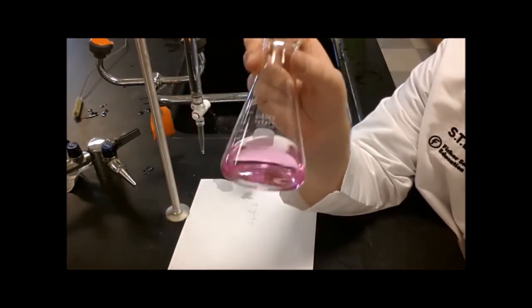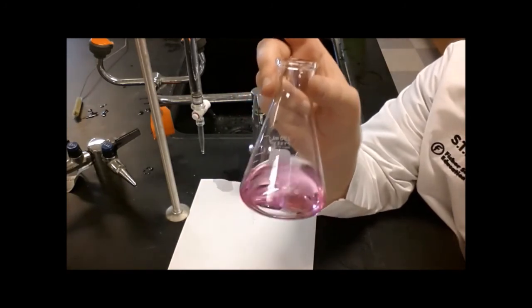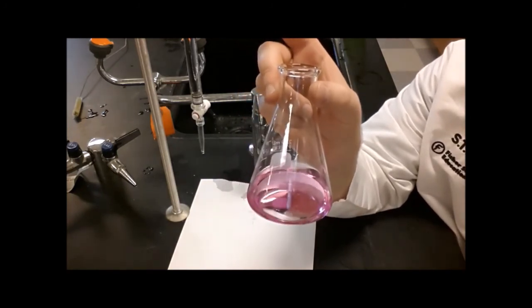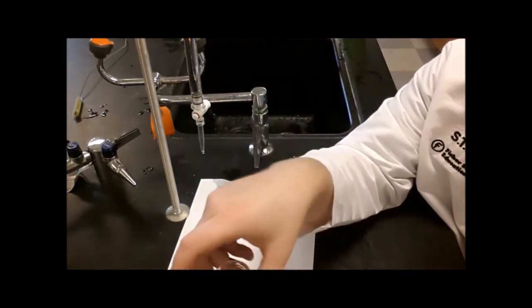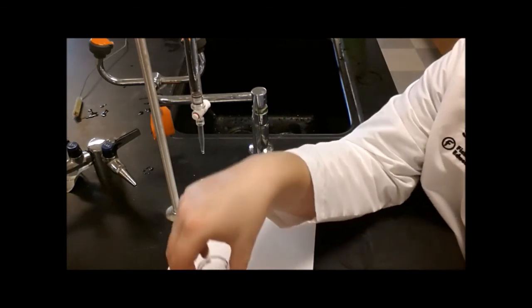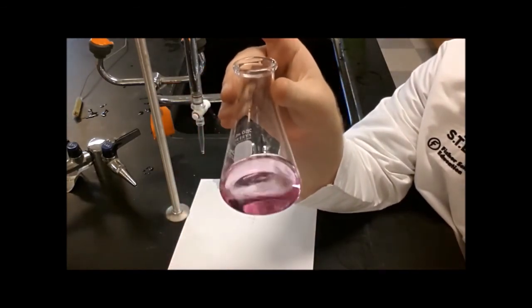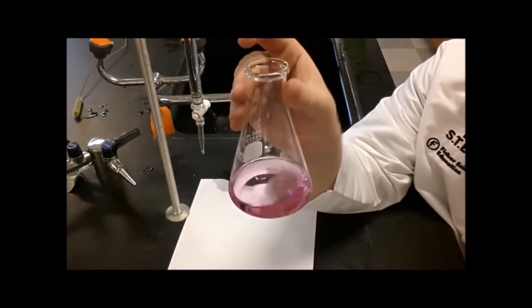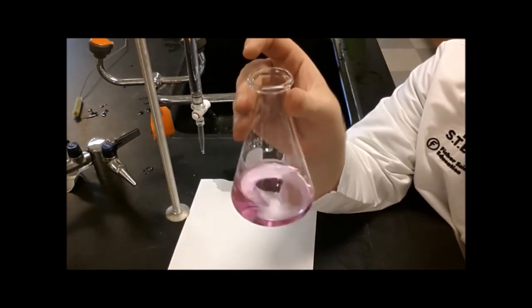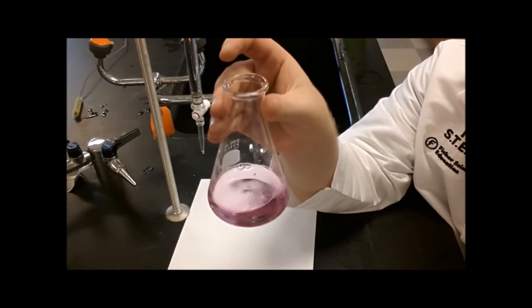So at this point, I'm done with my titration. I've reached the end point. The pink color is a faint pink color, and it's staying around for at least 10 seconds. I'm going to read the final volume from the burette, and then the volume of sodium hydroxide that I added is the difference between the initial volume and the final volume. So I'll just record the volume straight off the burette. Whatever it says, I'm going to record that volume. And that's how you do a titration.